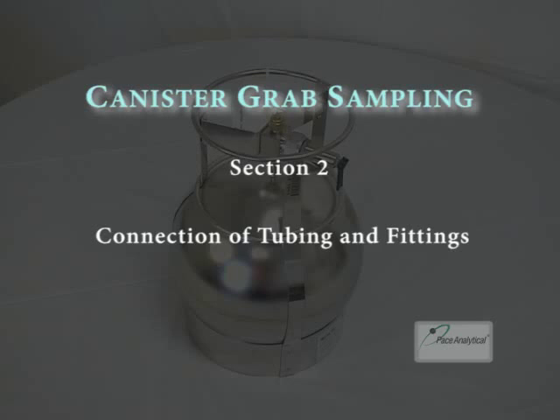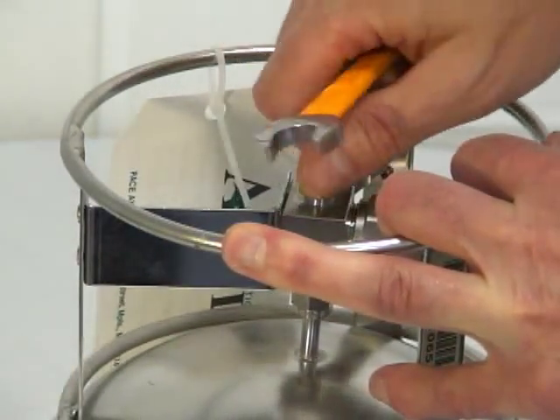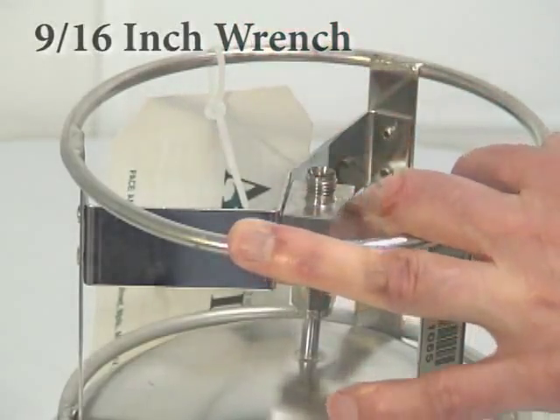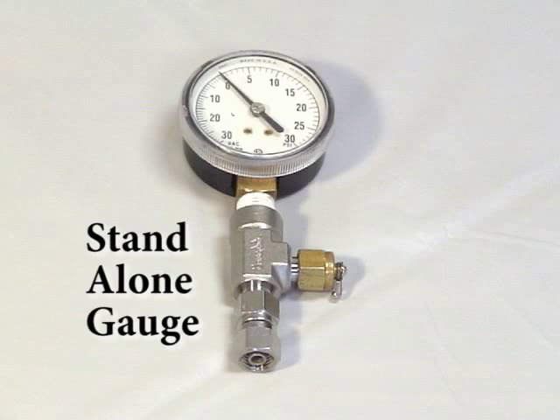Section 2: Connection of tubing and fittings to a predetermined sampling point. Now it is time to prepare the canister for sampling by making any necessary connections. First, you will need to remove the brass cap using a 9/16-inch wrench. If you were not sent a vacuum gauge or any tubing connections, you are now ready to move on to sampling steps in Section 3. If you were sent a stand-alone gauge, now is the appropriate time to connect the gauge on top of the valve to check the vacuum on your can.